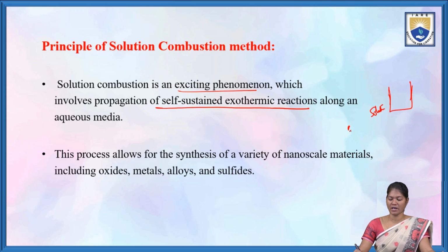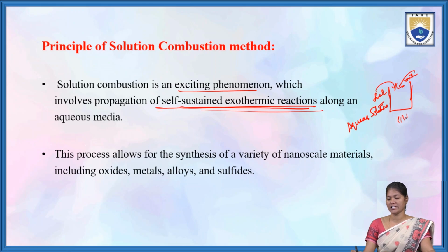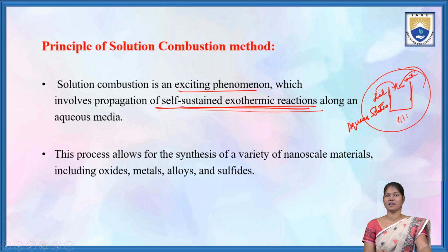So we take an aqueous solution, add fuel and then some metal precursors, so that when heating this solution, self-sustained exothermic reactions take place in this aqueous medium.